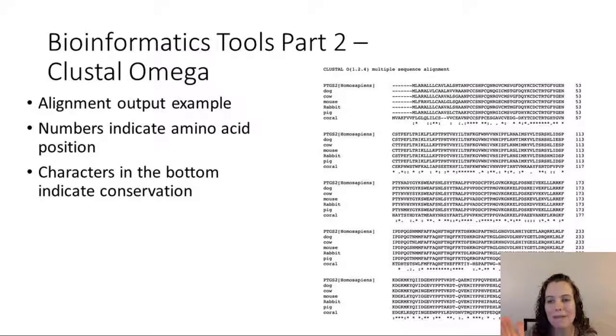So where you have alignment and consistency among all of the sequences, on the very bottom of the line you have the concordance of all the alignments, and it will show an asterisk there indicating what is exactly identical in all of the sequences. And if there is no alignment, no matching whatsoever, then you would have no symbol at the very bottom.